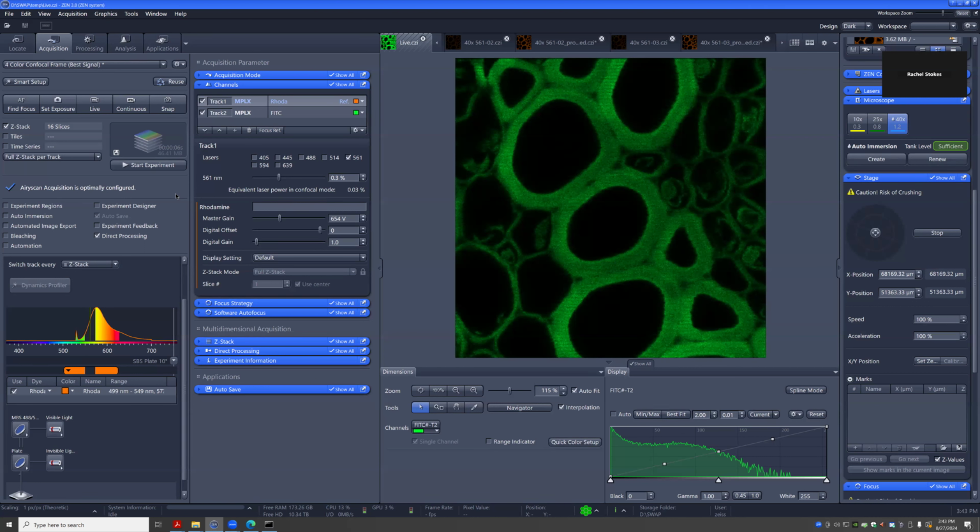Yeah, because here you have to work pretty hard to hurt yourself. You have to work tremendously hard on this system. Exactly, you have to be doing a lot. You saw it, right? This thing is trivial. It won't even shoot the laser out. This is specific training, and the training is less.